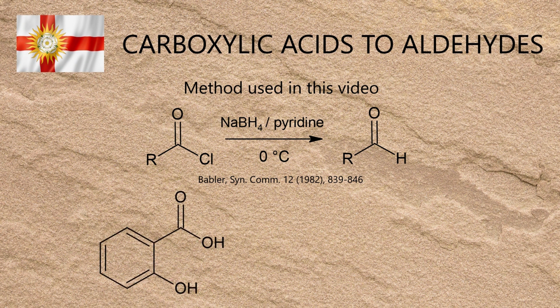The acid being reduced to an aldehyde is salicylic acid. In a previous video I demonstrated how to reduce this to salicylic alcohol, with the ultimate goal of converting it to salicylic aldehyde, but I found this method was more elegant.